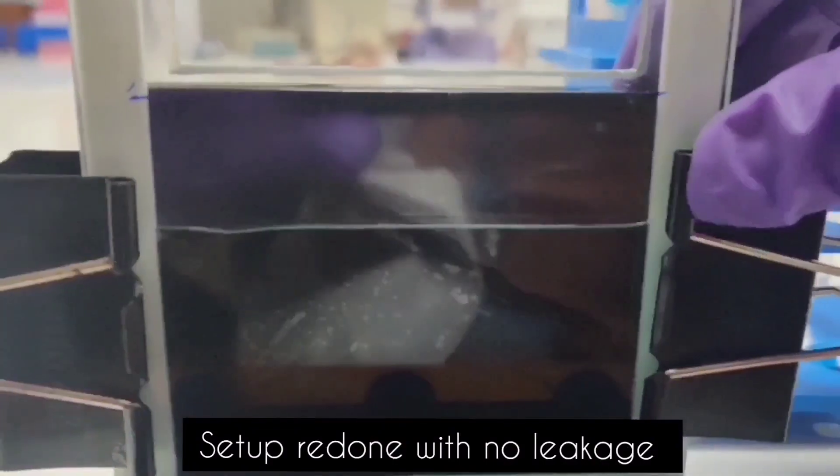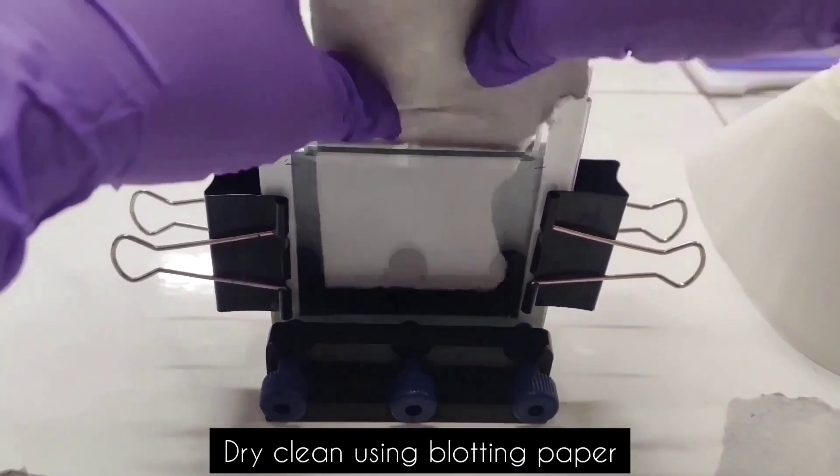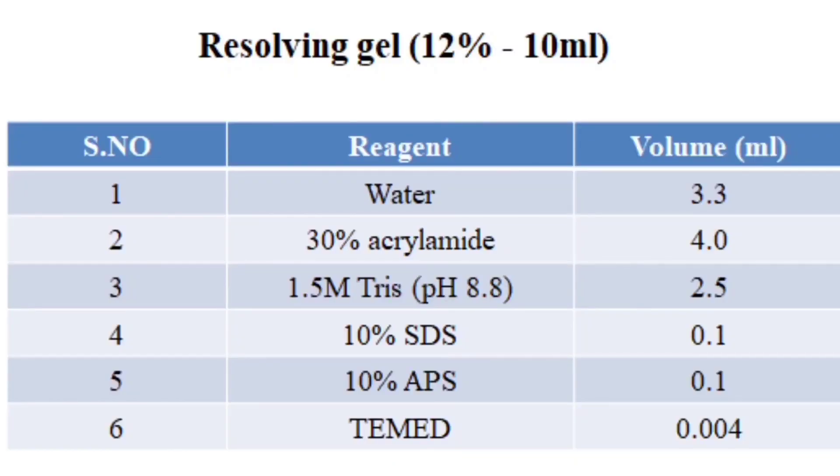In this setup, we can see that there is leakage. So the setup is reassembled again, ensuring the setup does not leak. We pour water again to check for leakage, and the water is then removed using blotting paper.